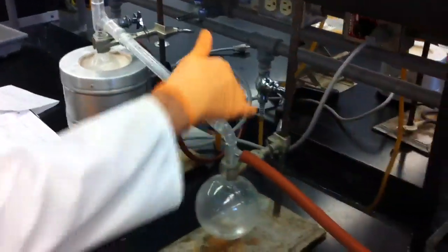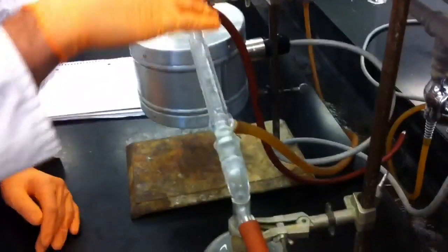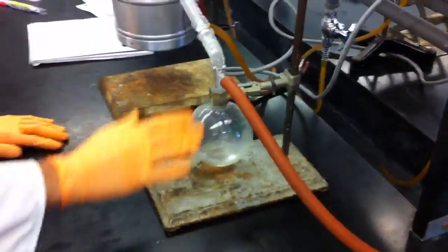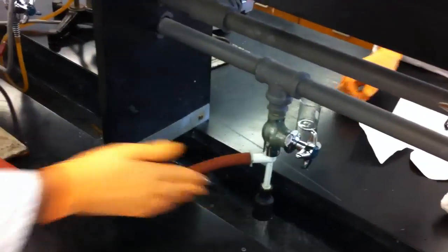Now, the condenser has two hoses attached, one to supply water and one to get rid of the water. Attached to your band is a hose which is connected to your aspirator.